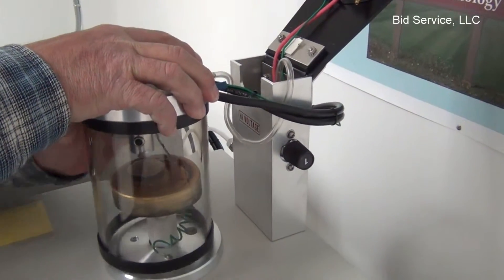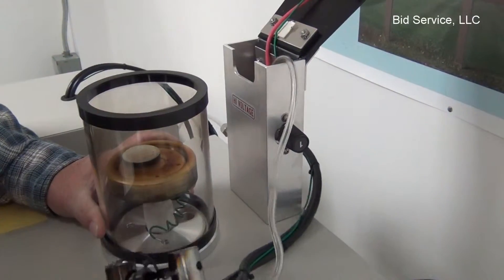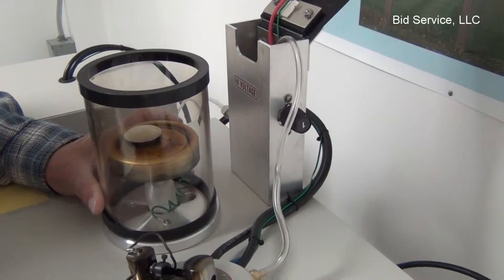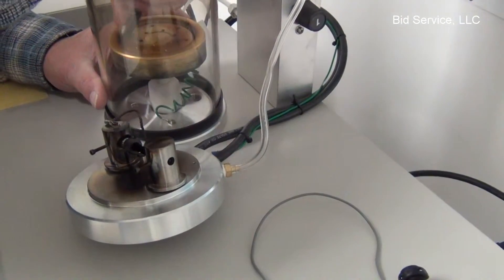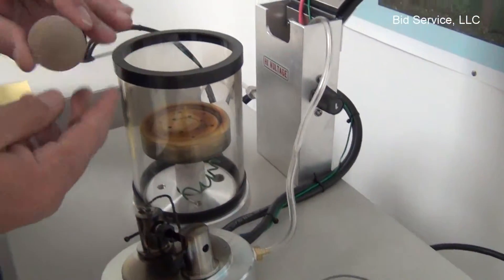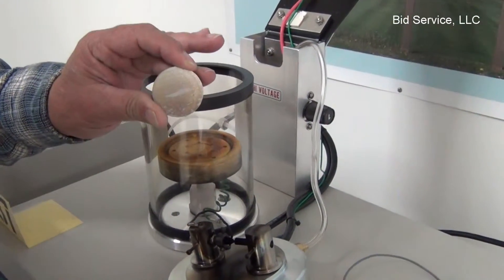Give it a couple seconds to go to atmosphere. At that point I can take the top off, lay it on the side, and you can see the target here has gotten a coating of carbon on it.